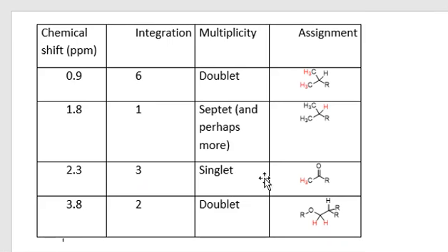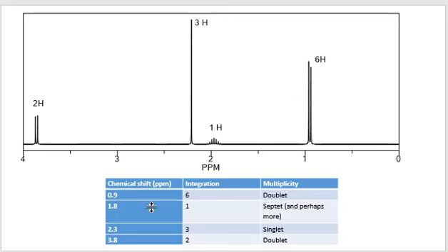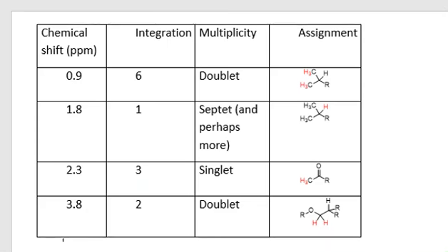So this is the same table. I've just transferred it, and it's now all on a white background instead of having the different columns and rows being different colors. It's the same information, just transferred to the next page.